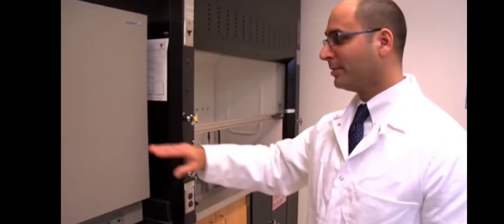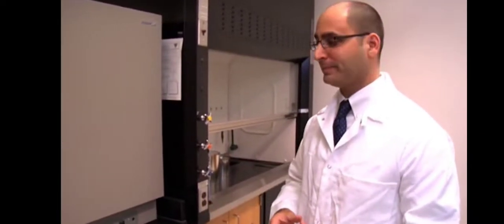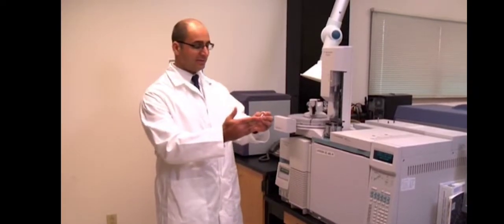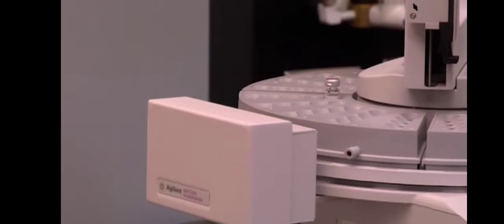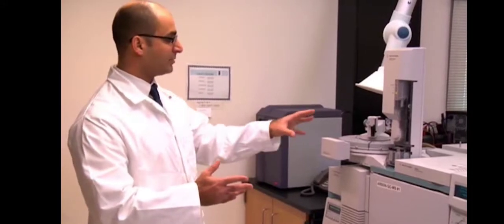Seal the can back up, place it back into the oven to perform a passive headspace procedure using the carbon strip. Once again, we would use another predetermined period of time, usually anywhere from 2 hours to overnight. After that set period of time is up, we would take the can out, let it cool, and then take it over to the hood so that we can remove the carbon strip and elute it with a proper solvent. After we elute our samples, we take the vial that contains the sample and the solvent, place it into our auto sampler on our instrument. At this point, we would set up the instrument to run, get the auto sampler running, and that would take over.